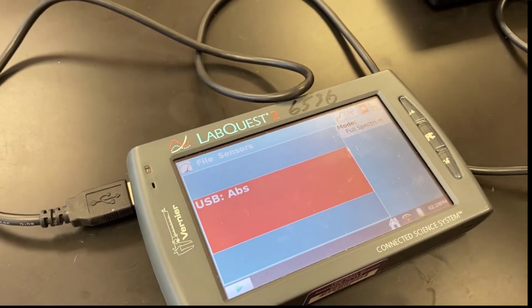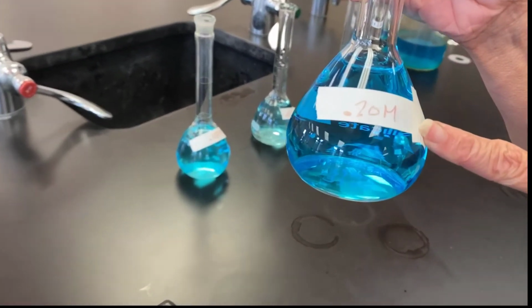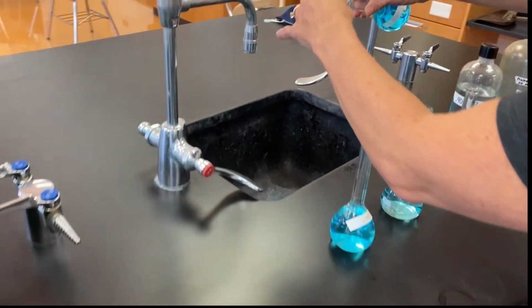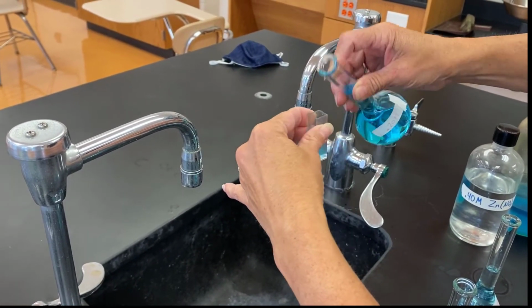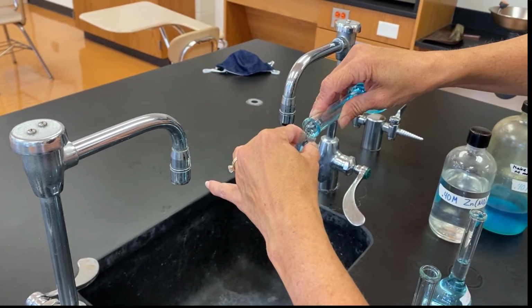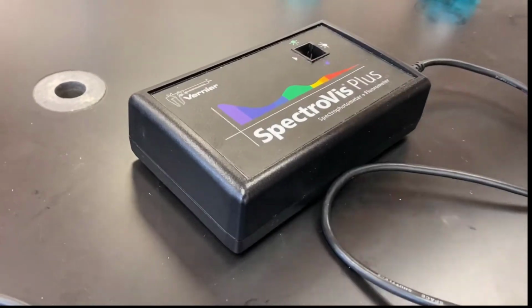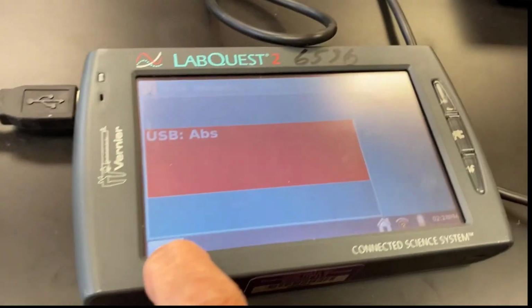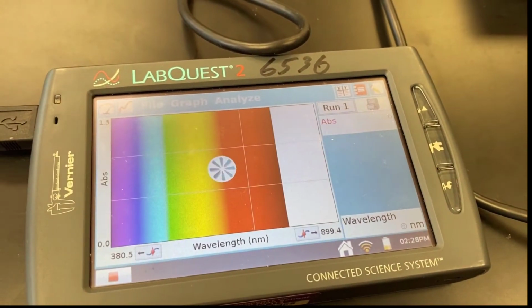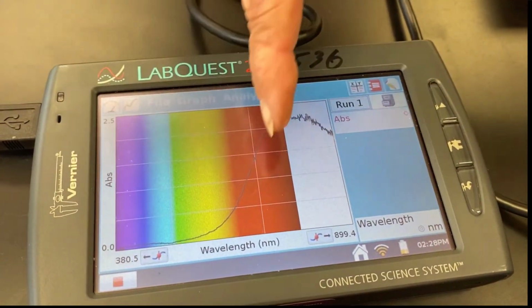I'm going to take a pre-made solution that I know the concentration of, 0.2 molar copper(II) nitrate. I'm going to fill my cuvette with that. A little bit more. And then I'm going to put this into my SpectraVis, and I'm going to run a full spectrum scan. Okay, and we can see our curve here.